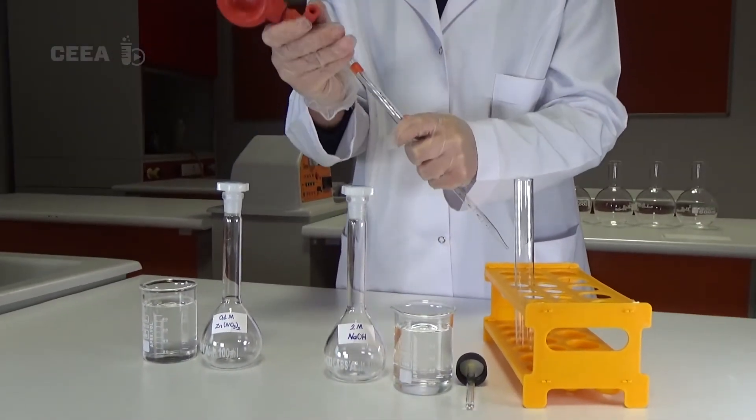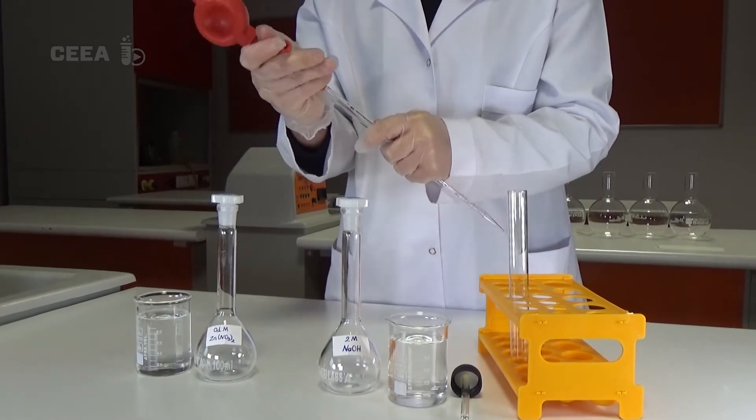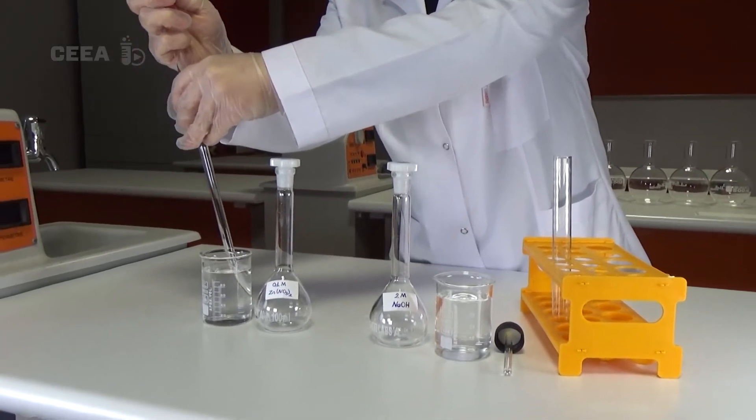Using the glass pipette, a solution of zinc nitrate is dropped into the test tube.